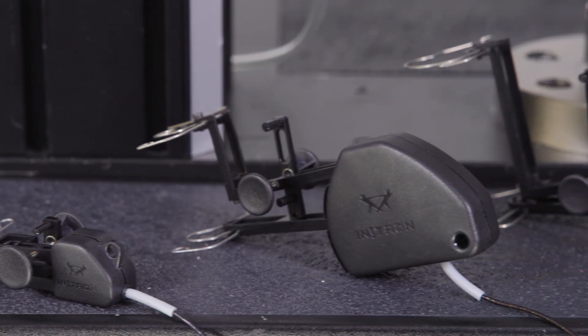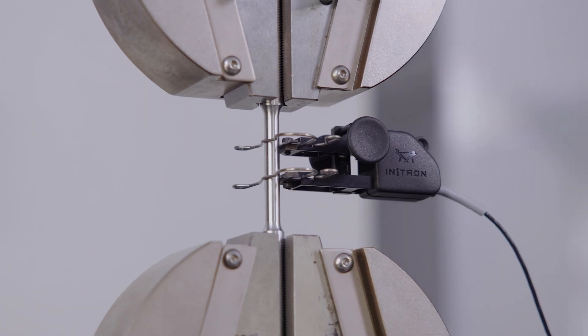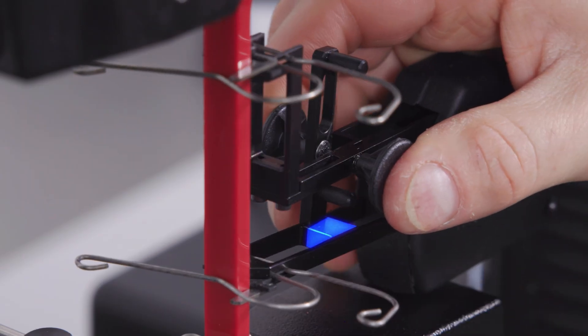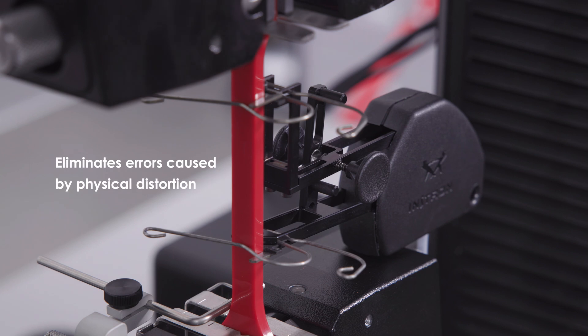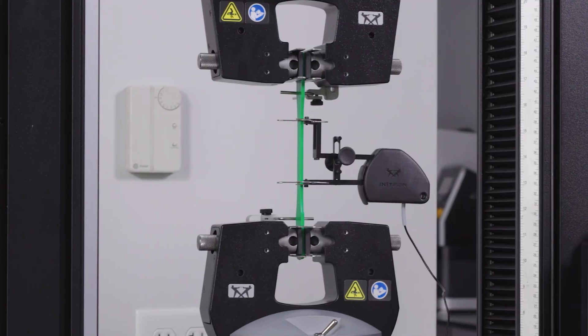These devices are available in gauge lengths ranging from 8 to 100 millimeters to accommodate various specimen geometries and travel requirements. They also have a lightweight, rugged, cross-braced design that eliminates errors caused by physical distortion, while a built-in protection mechanism prevents damage caused by overextension.